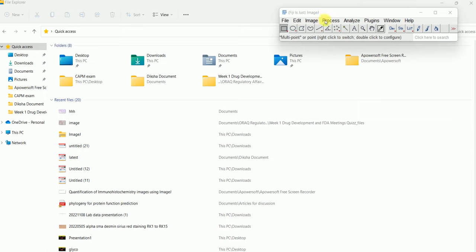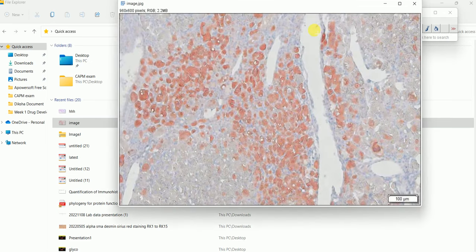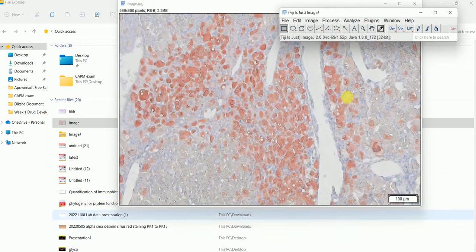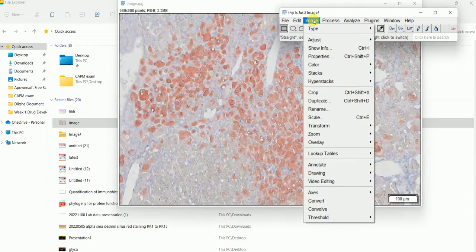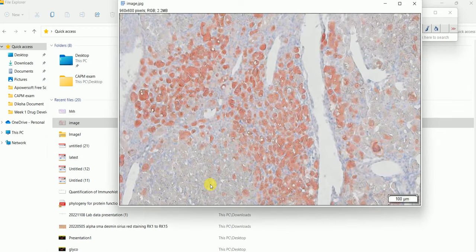For the image from which you want to count the number of positively stained cells, you just have to drag and drop that image into the image software. After dragging and dropping, you have to go to Image, because in this image these red particles are the positively stained particles. The red area is the positively stained area and we want to count the number of cells present in this red area.